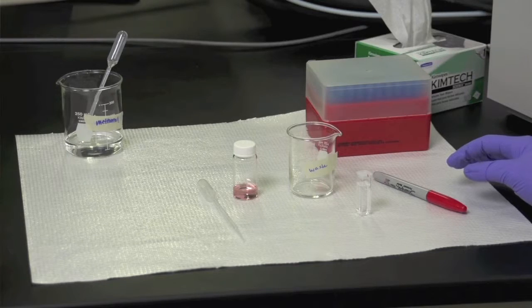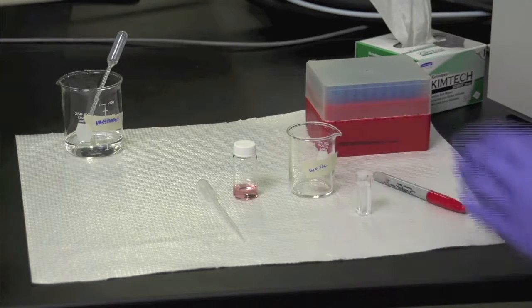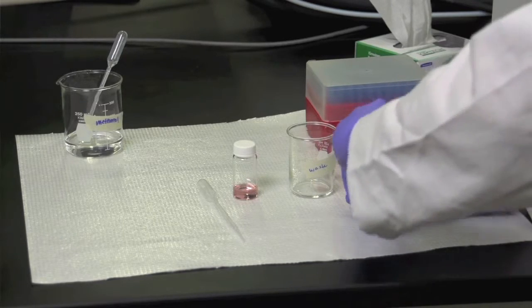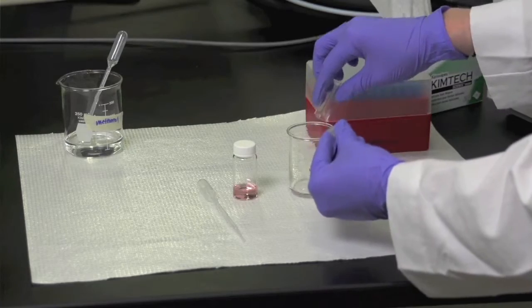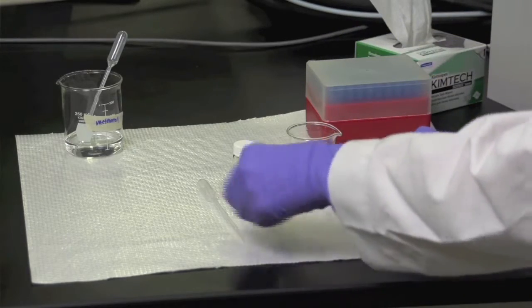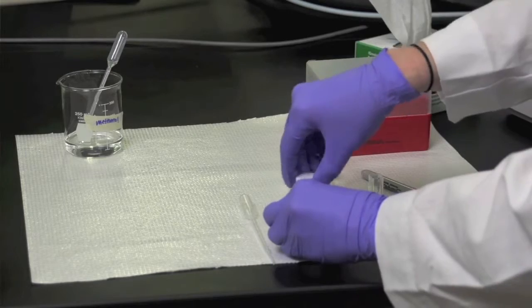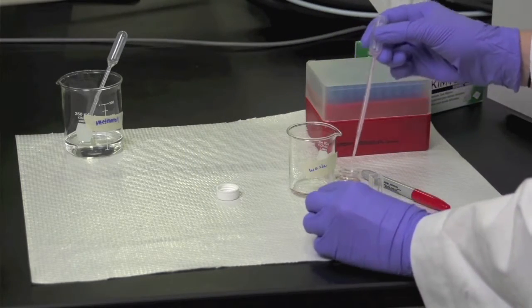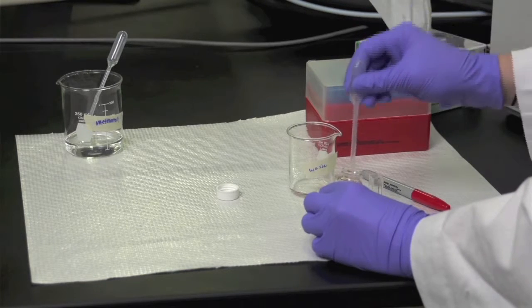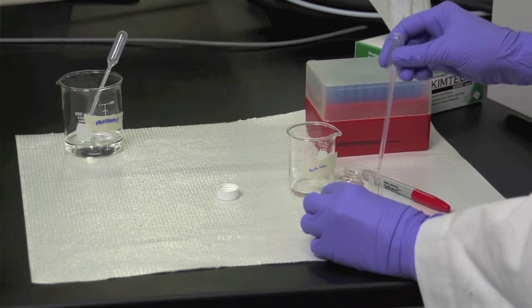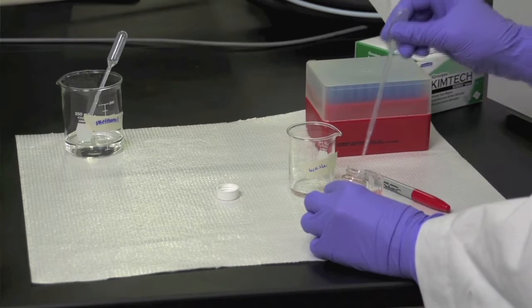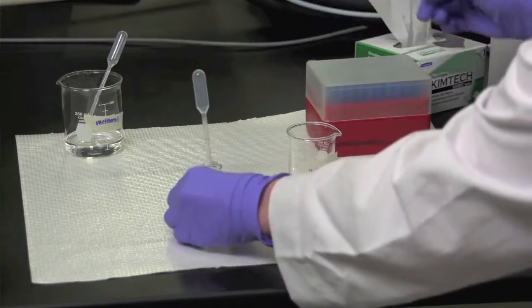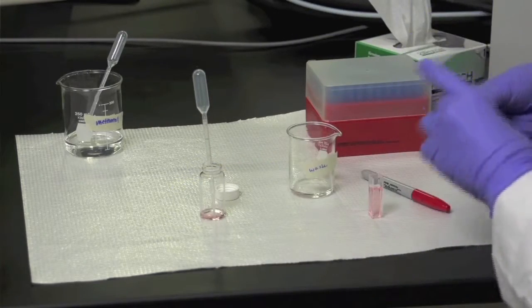To collect the cyanine dye spectrum, we'll want to use the same cuvette as we did for the background so that the inconsistencies are the same. Dump out the methanol into the waste, and then fill the cuvette two thirds of the way full with the dye solution. It needs to be two thirds of the way full so that we can ensure that the light beam goes through the sample.